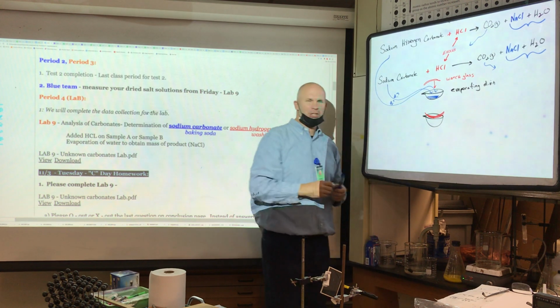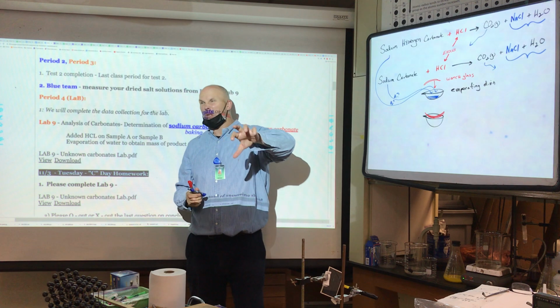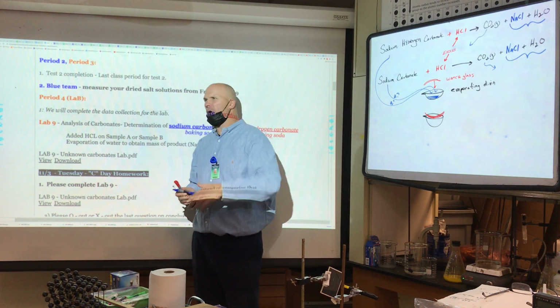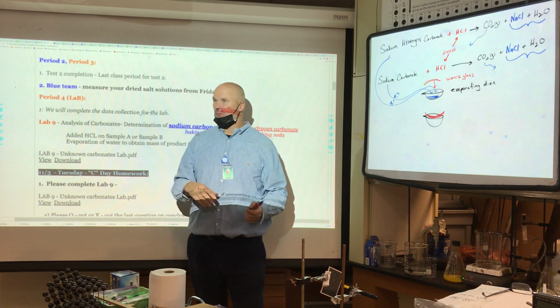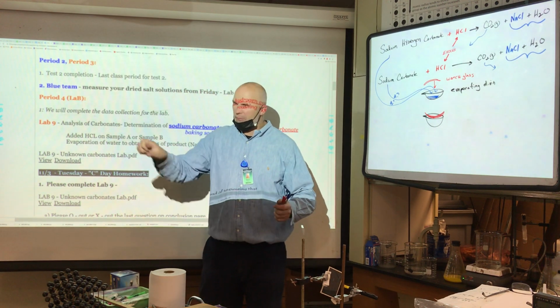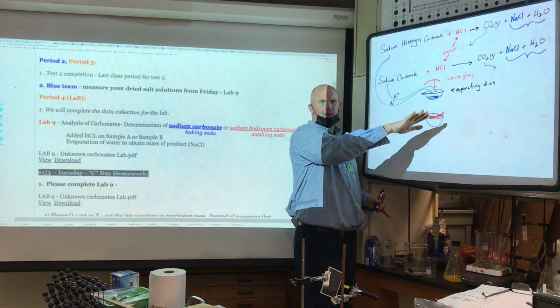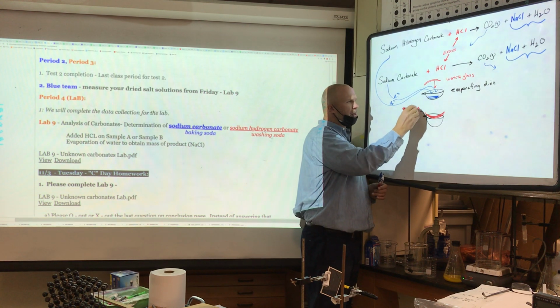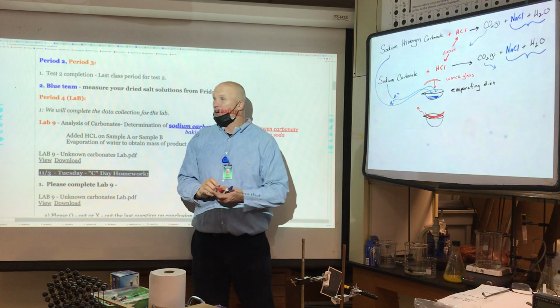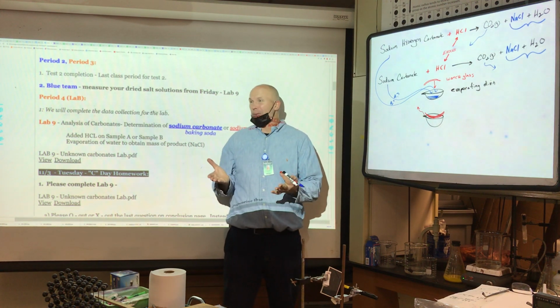And the reason for the watch glass is that we're going to heat. Usually I heat for a couple days, really warm, so it evaporates off very gently. But since we're in a rush to get this done today, we're going to heat violently. We're going to turn the hot plates on 550. I'm going to drop the watch glass right on top. There's still going to be a little opening so that the water vapor can leave, but the watch glass is there to trap any of the water or splattering of the salt.